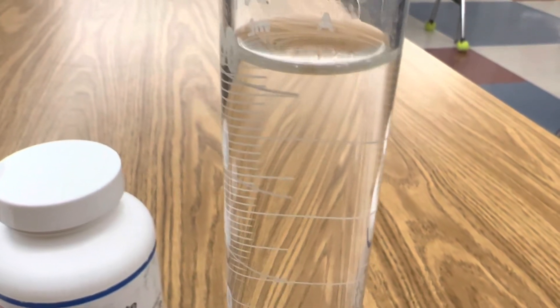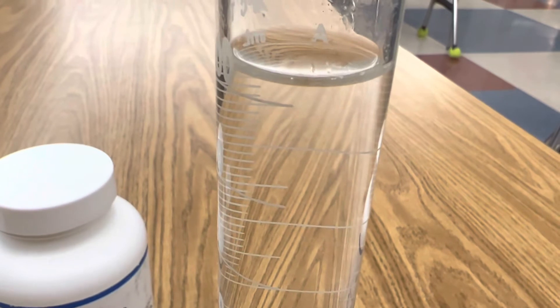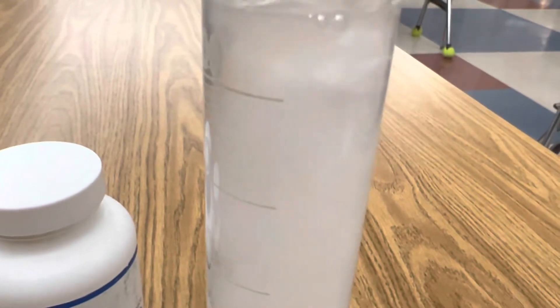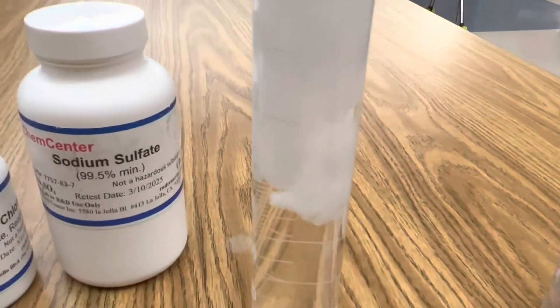So as I pour in my solution of sodium sulfate nothing will happen at first and then suddenly you'll see this very white cloudy precipitant form. There it is. Look at that.